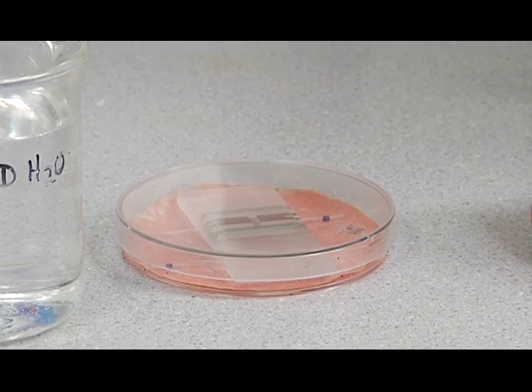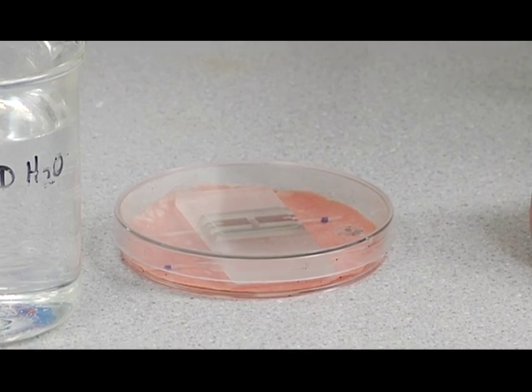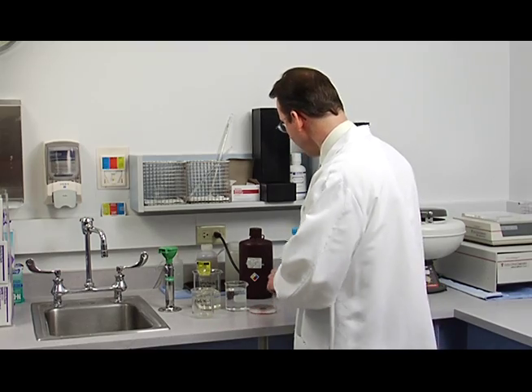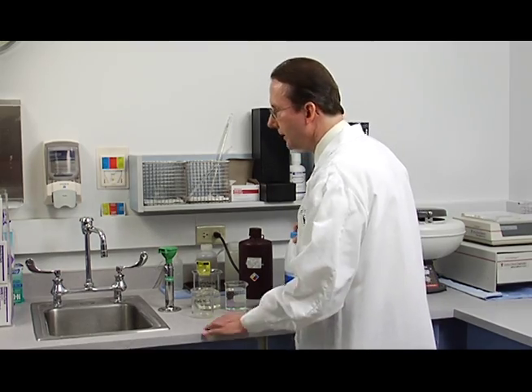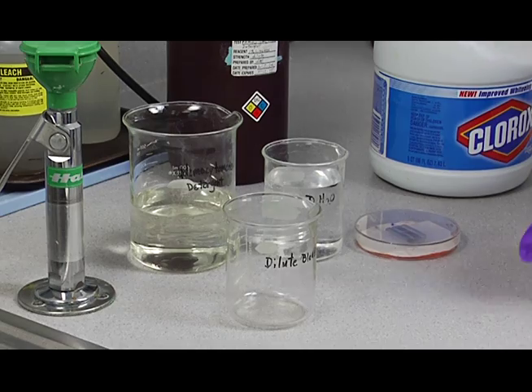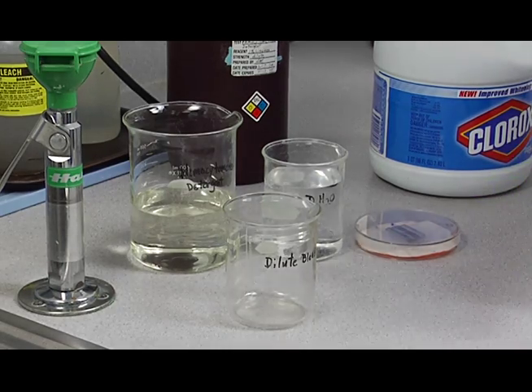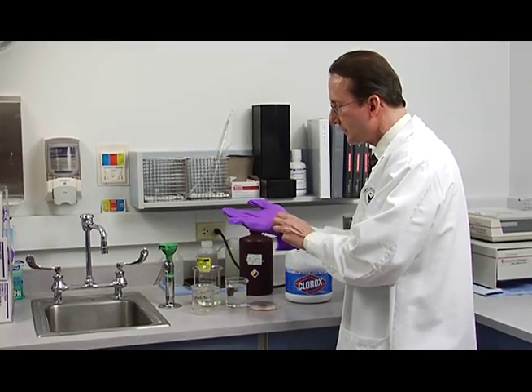Before you perform the manual cell count, you need to wash your hemocytometer. It needs to be thoroughly clean. The first step of that is to get your reagents and solutions ready. So you'll need to put on some gloves for that.